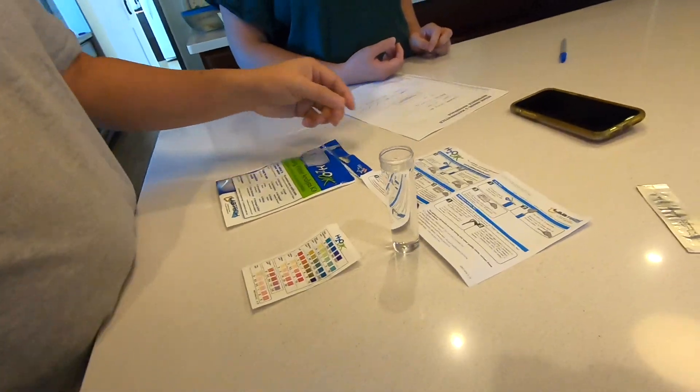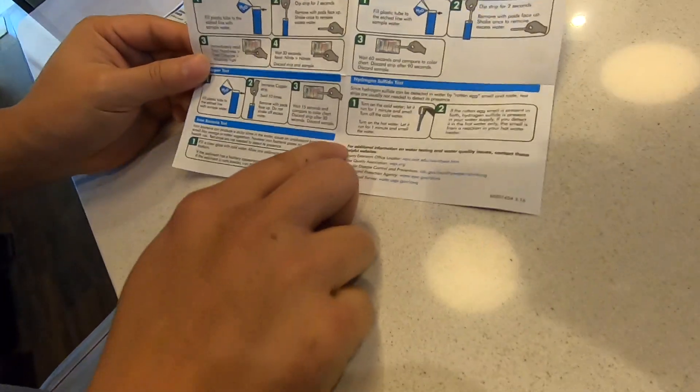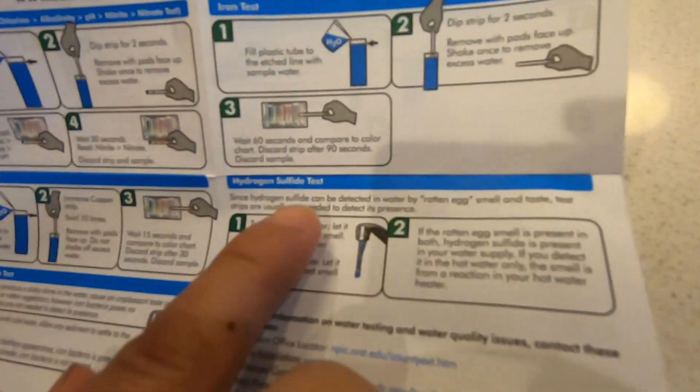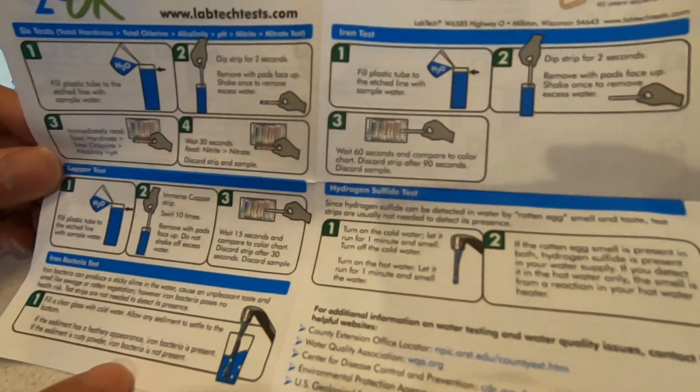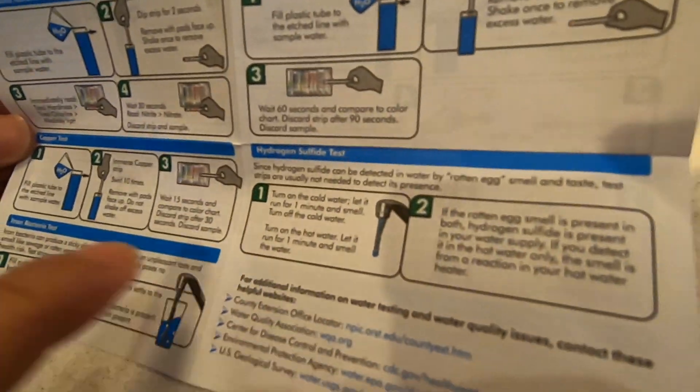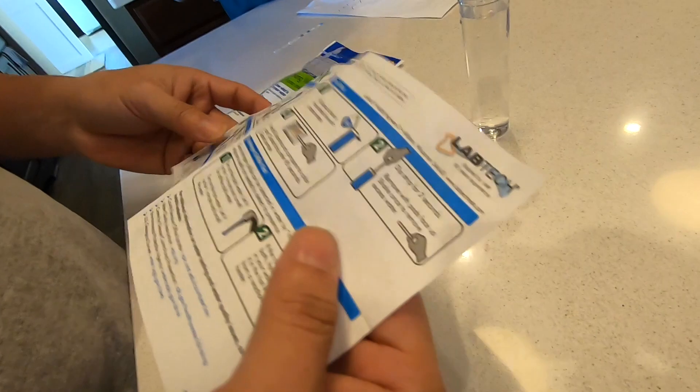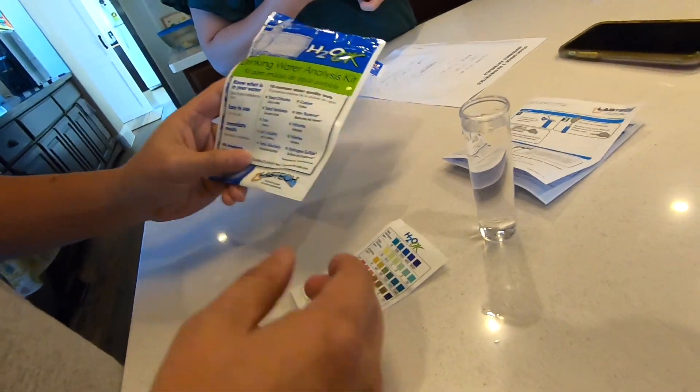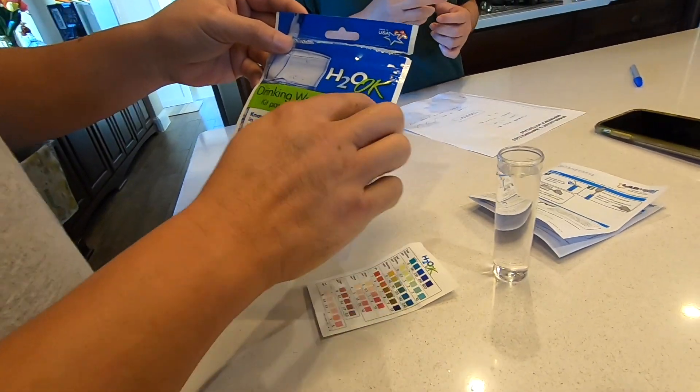That's it. I've done all the tests except for a couple of tests that they have here. They have the iron bacteria test and the hydrogen sulfide test. They don't require any test strip, basically just follow the instructions, fill a cup with water. So you can do those. I'm not going to do that in this video. So far it's been pretty easy and it is pretty cheap to get this Labtech H2O OK.